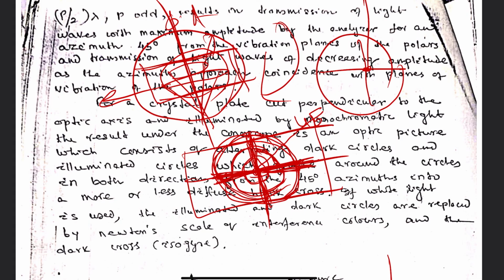If the position of optic axis would have changed, then there would have been shifting of the color rings and the shifting of this point. As it is fixed with respect to the rotation of the stage, the position of optic axis with respect to rotation is found to be fixed.